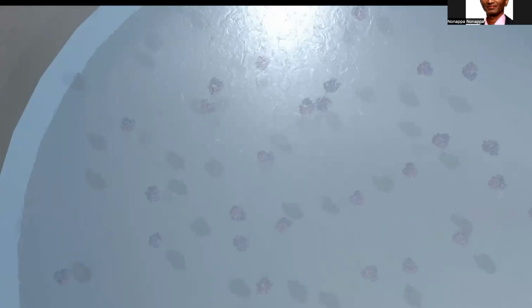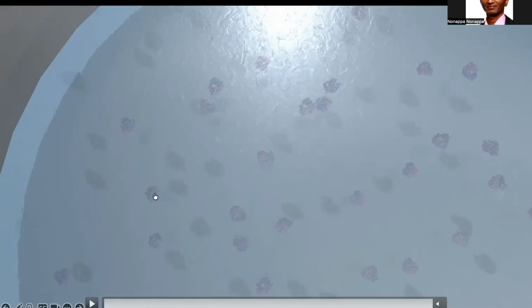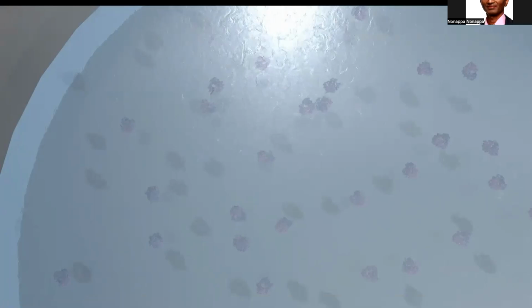This specimen is also maintained in the instrument at liquid nitrogen temperature, and nowadays even liquid helium temperature. Now if you take a biological particle such as a virus, they are all of the same size, atomically precise. So the idea developed by Joachim Frank is that if you take 200,000 to 1 million particles of the same type, you can get a three-dimensional structure. Why? Because when you freeze, the particles are randomly oriented. So if there is a certain symmetry, these randomly oriented structures can be categorized into different groups. It gives all possible views of this particular particle.